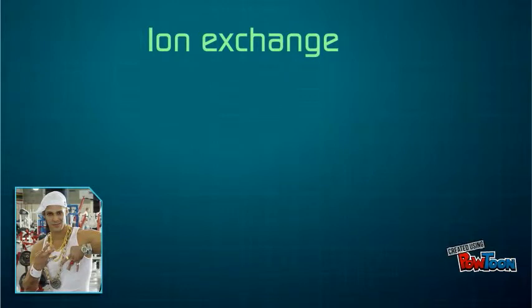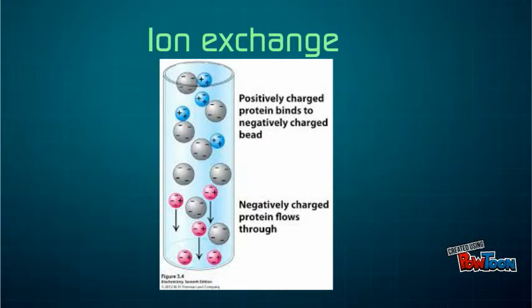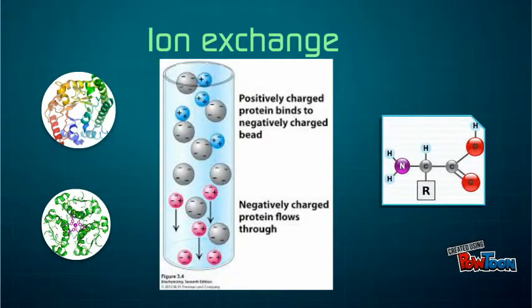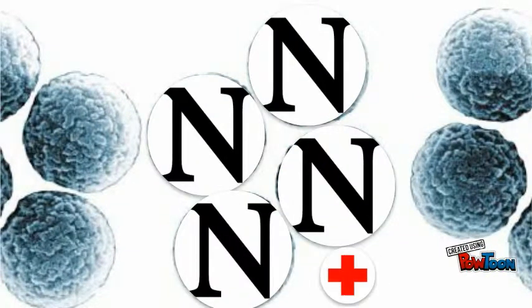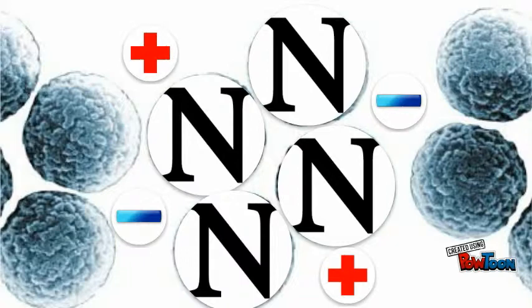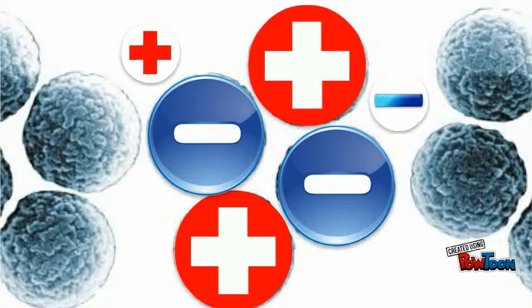Alright. Ion exchange chromatography is used to separate molecules based on the charge that they take on at various pH values, and can be used to separate anything from whole proteins to amino acids. The first step is to fill a column with resin beads of a neutral charge, and then those beads are given a charge opposite of that of the desired molecule using elution buffers, so that the undesired molecules elute first, while the desired molecules stick to the resin beads.